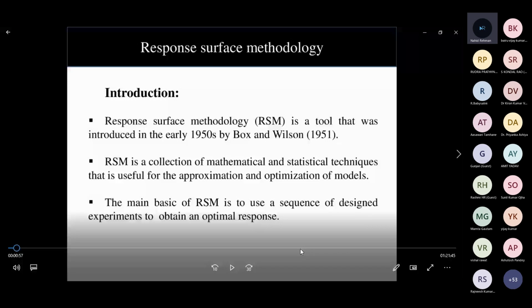For that, you have to understand what a parameter is. A parameter is the condition which you want to optimize. Say you want to optimize temperature. Keeping everything else standard, the standard media and other conditions, you will vary the temperature. That means you set your experiment at various temperatures in triplicate, and then you find out the temperature at which you obtain the maximum hydrogen.